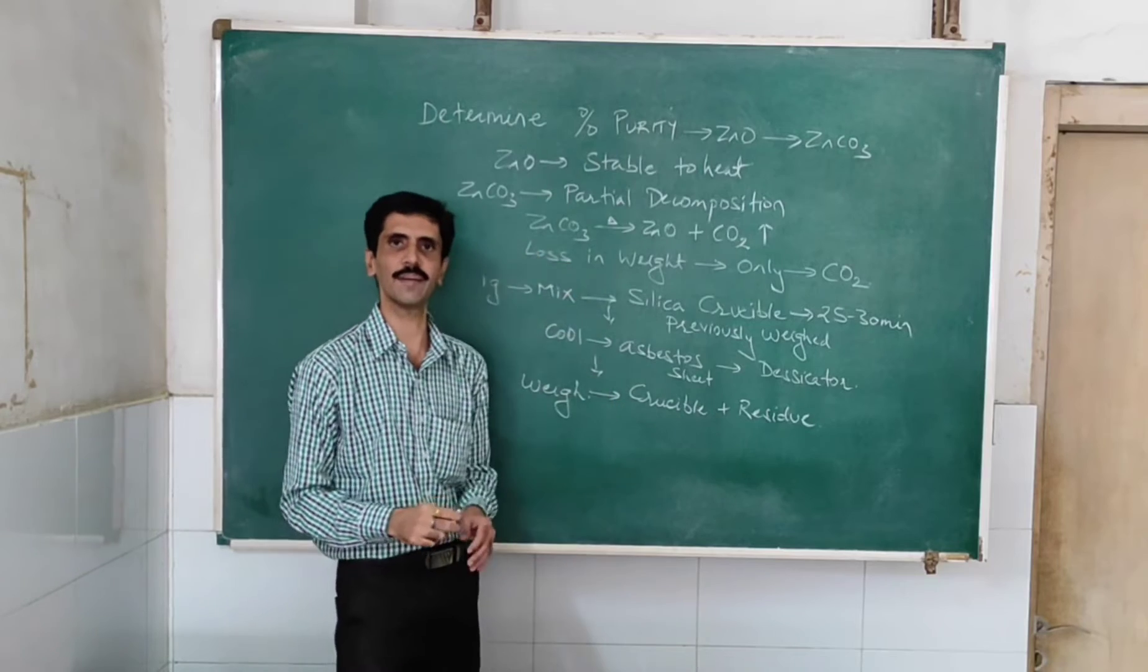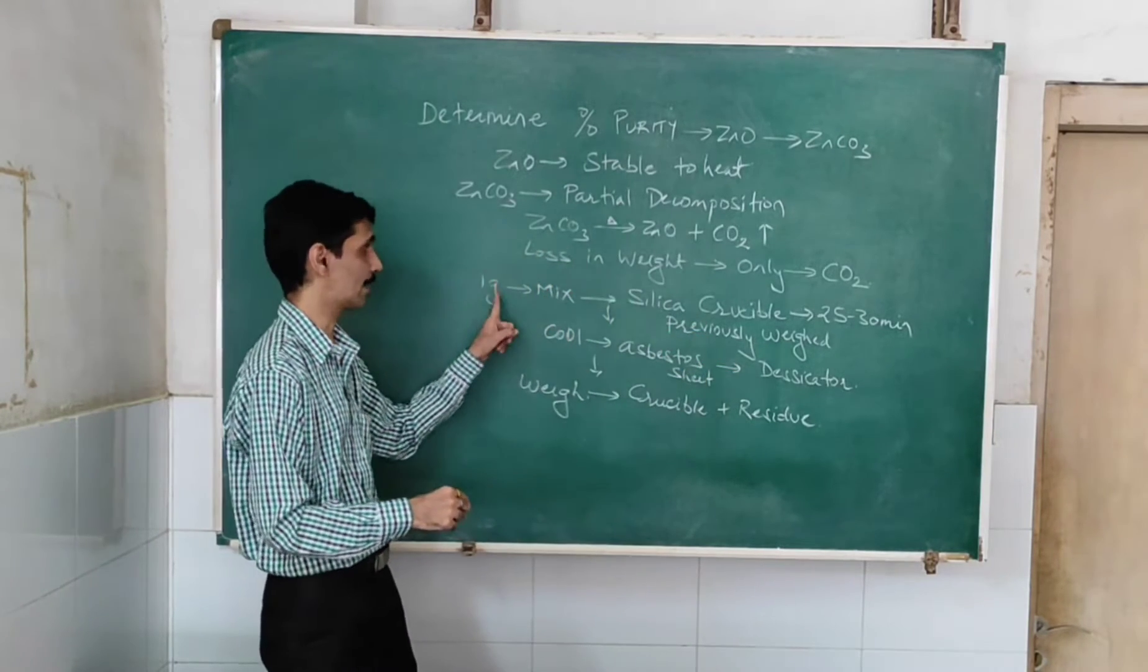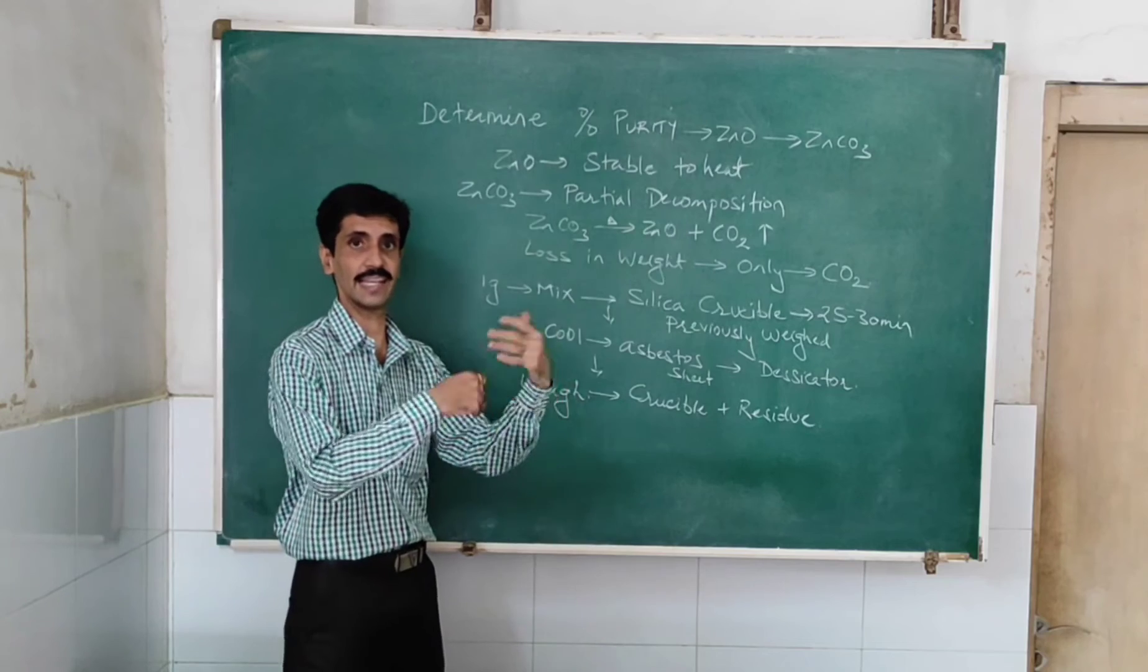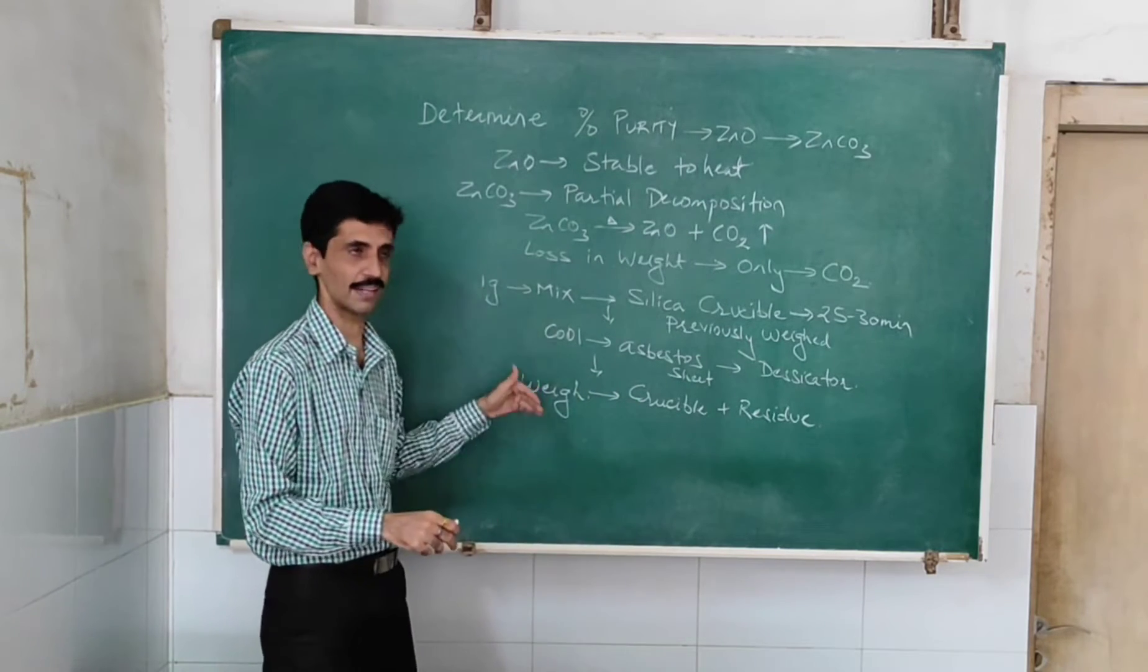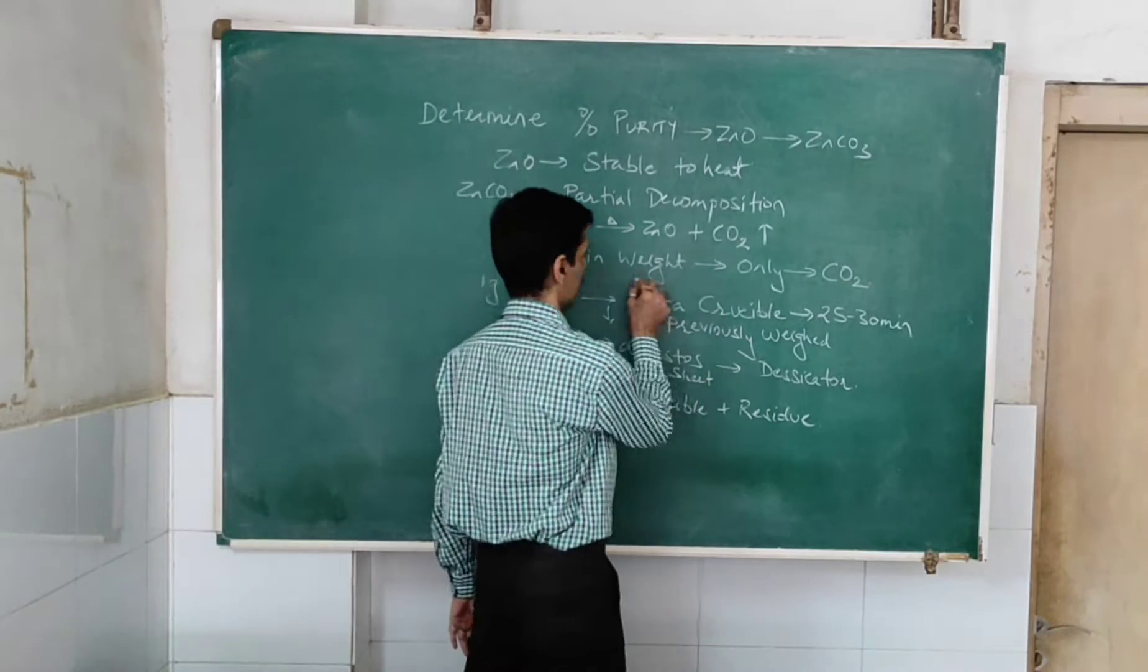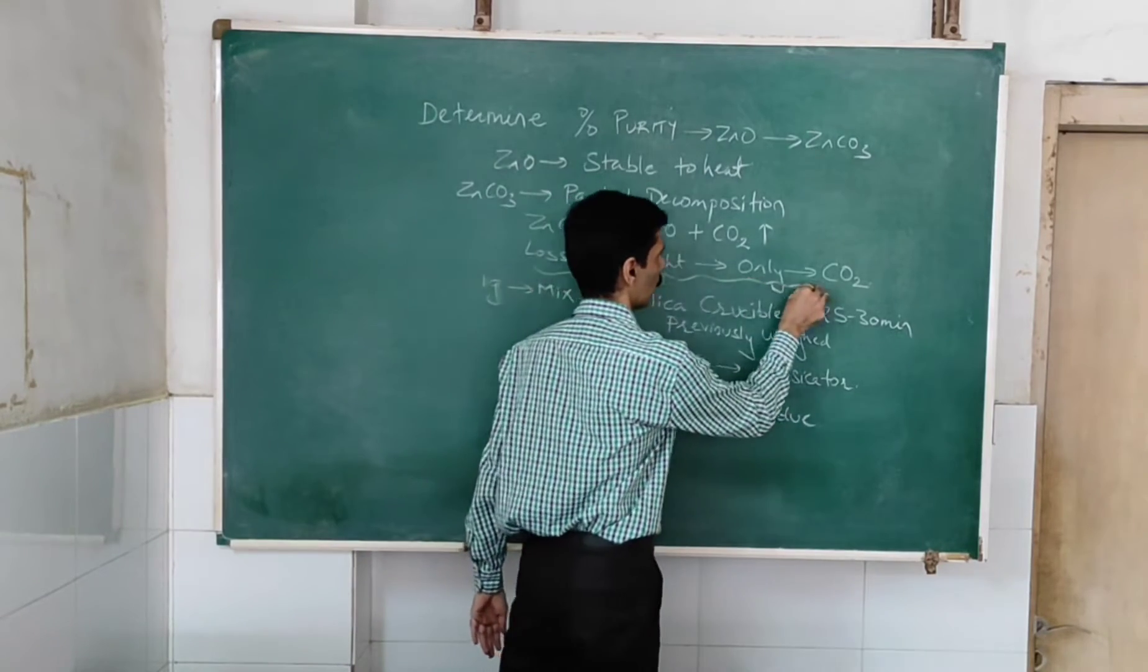So initially, I have the weight of crucible as well as the one gram of the mixture. And then, I heat it, cool it, and after that I am going to take the weight. So obviously, there will be a loss in weight. That loss in weight is only due to carbon dioxide.